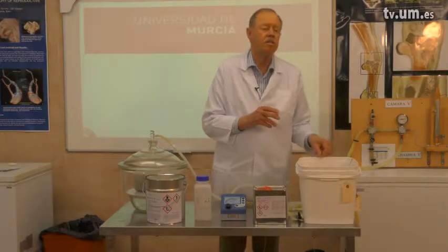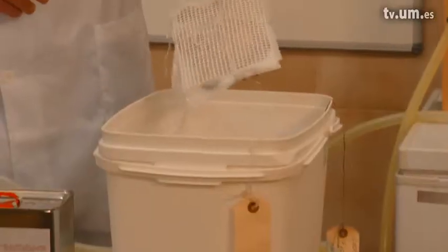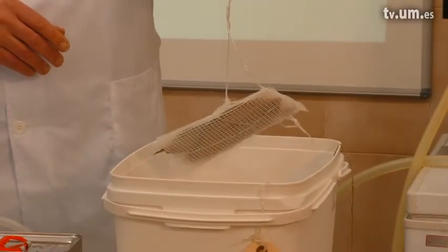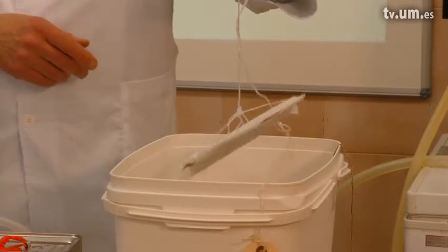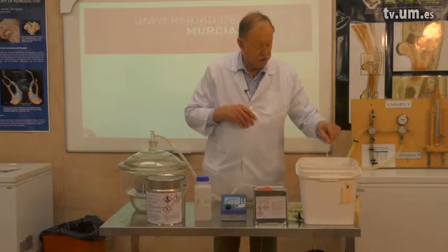To start the impregnation, you need a dehydrated specimen. Here we have a bundle of dehydrated body slices packed, and you can transfer it directly into the impregnation mixture.